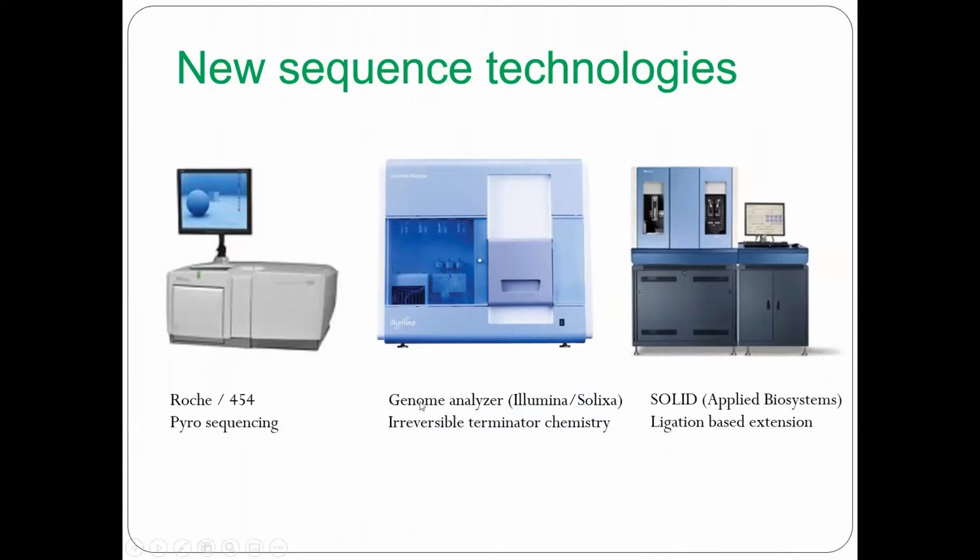At present, Illumina is the most used sequencing technology for genome sequencing as well as transcriptome sequencing. And pyro, still a few labs use it. This is a transition from Sanger to the present Illumina.